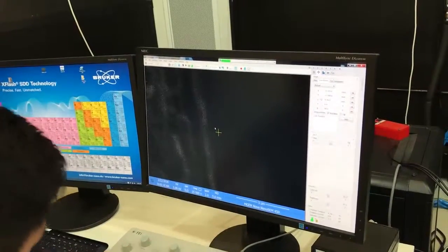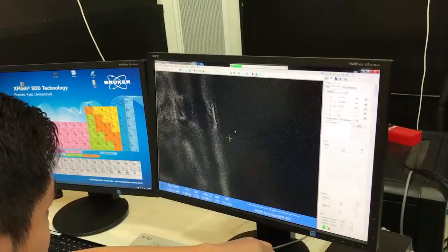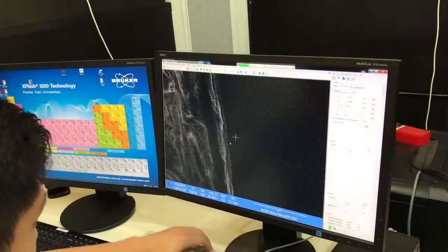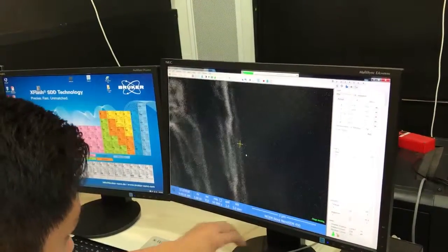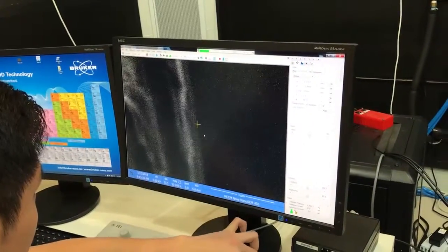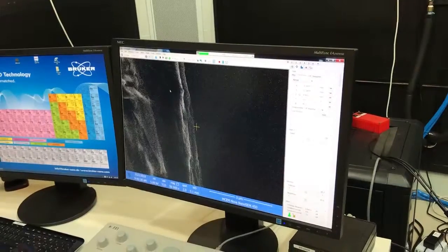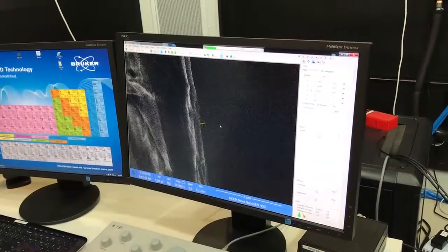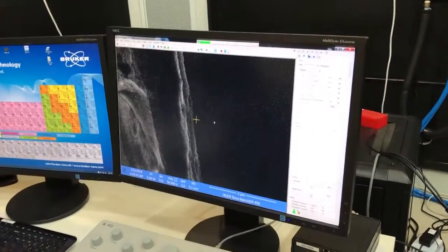The secondary electrons spiral up under the influence of the field from the objective lens, up along the optic axis, and they get attracted by this roughly 10 kV positive potential to the detector. It's very good at discriminating between secondary electrons and backscattered electrons. So this is almost a totally pure secondary electron image from the specimen.